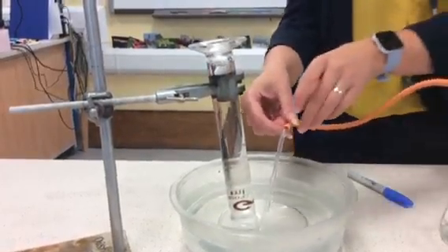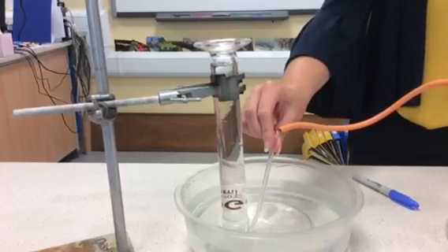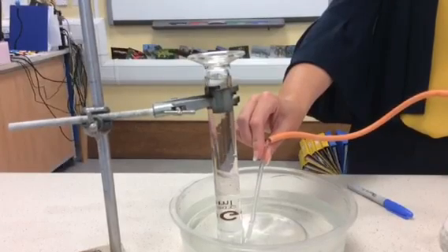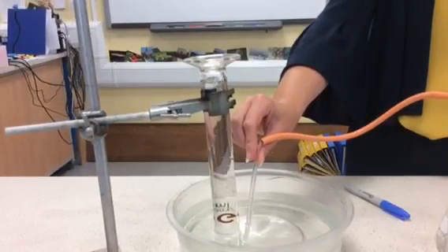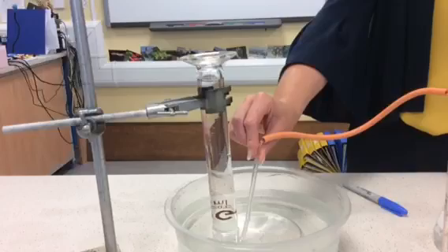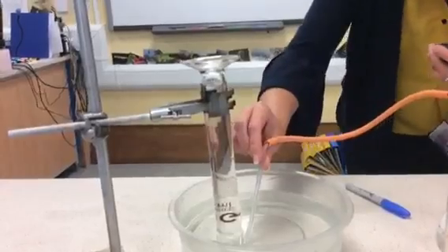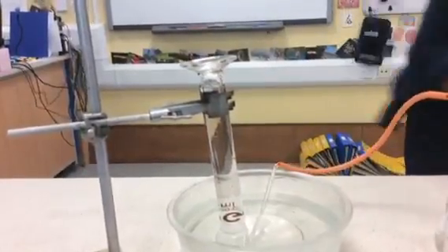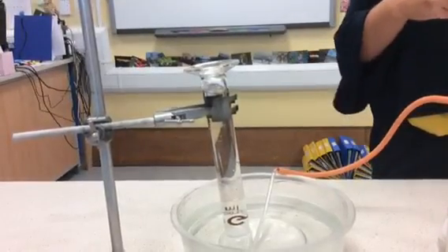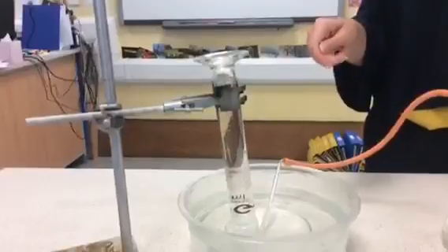Okay, so make sure you're able to write a word equation for this reaction. So zinc plus sulfuric acid, think about what it forms when the zinc and the sulfuric acid react together. Okay, so we're producing few bubbles of hydrogen gas here. On our first 30 seconds we are on 8 cubic centimetres. So if we write 8 cubic centimetres for our first 30 seconds, then we're on to our next 30 seconds. See what volume of gas we'll produce.